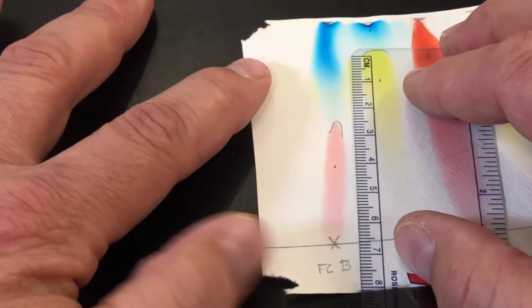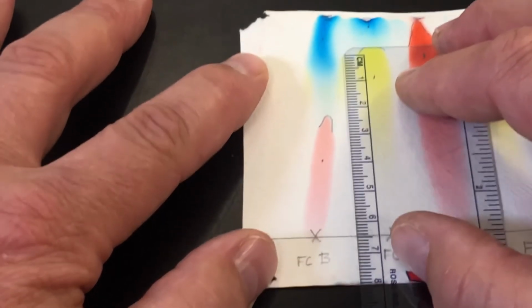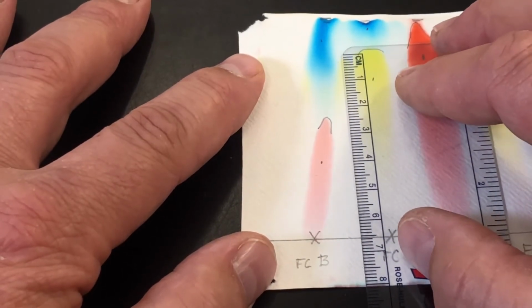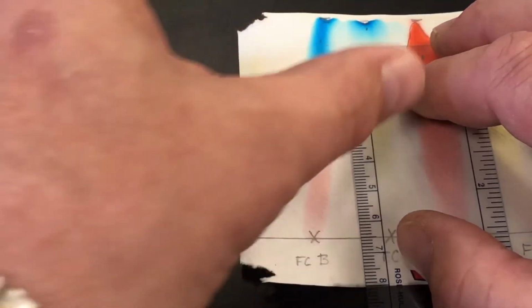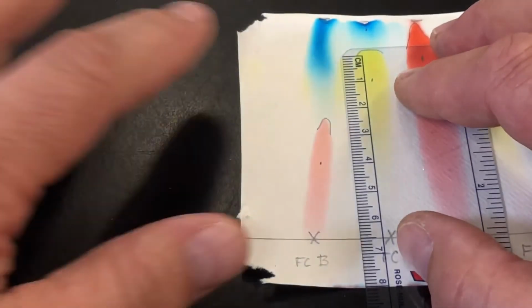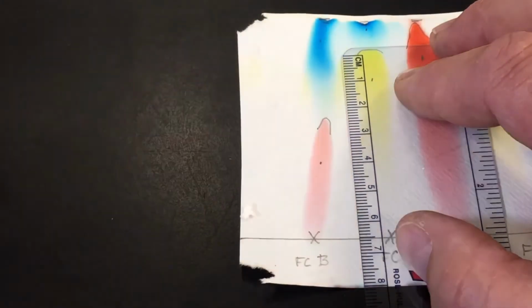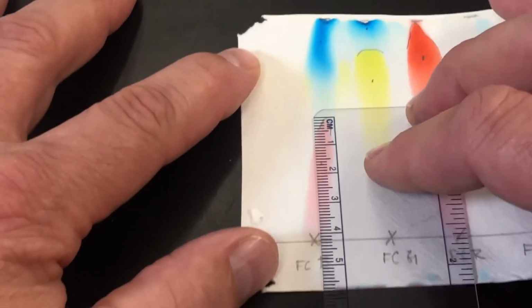Okay, this yellow traveled, at the very tip, both of these traveled about the same, so about 6.5 here. In this blue, it almost looks like this blue pushed that yellow out of the way. I don't know if you can see that. As it was traveling, maybe it was a heavier molecule, it moved those other lighter molecules of yellow out of the way. And so that could have happened.